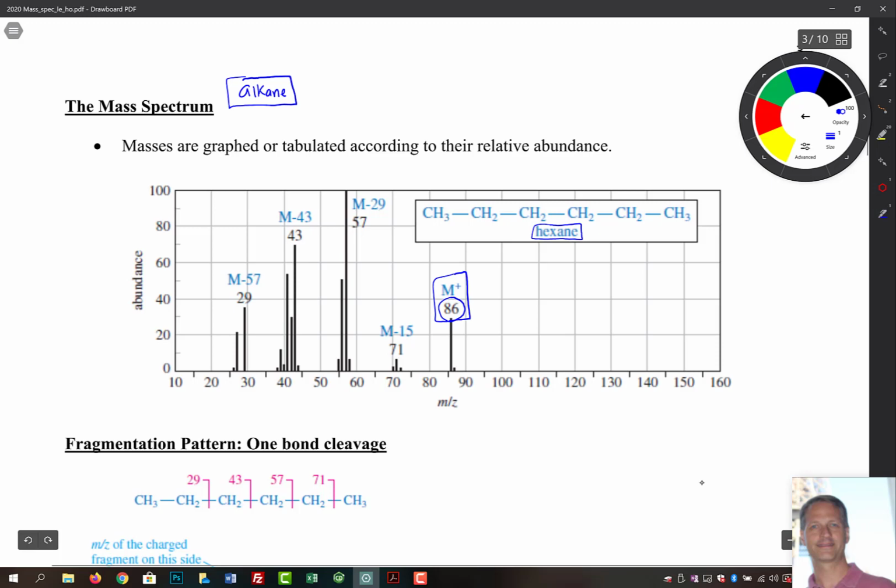So if we had, we'd guess here, maybe we have 7 carbons. So if you have 7 carbons, then that's 7 times 12. That'd be 84. So then that would leave you with a molecular formula of C7, right? 84 and 86 gives you 2, H2. That's unlikely, right?